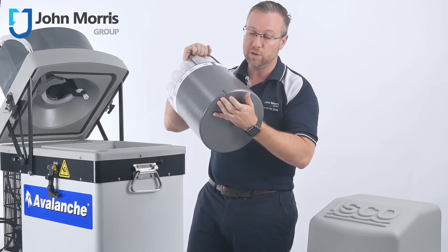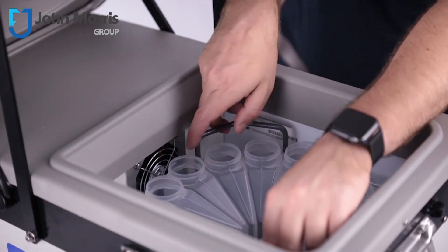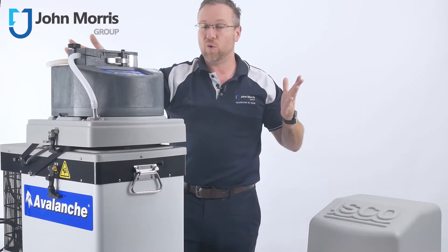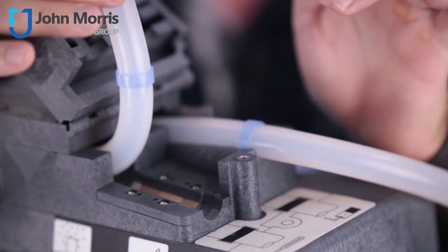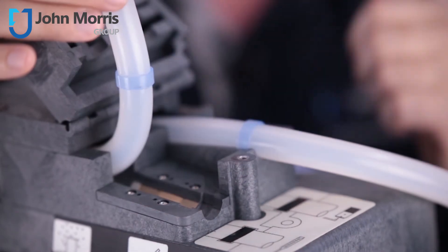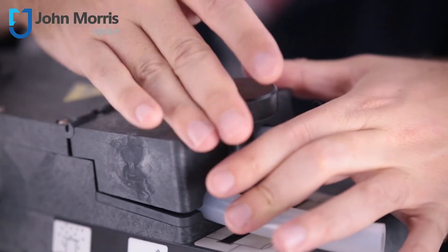On the bottom of the bottle kit, you'll notice there's a little groove which helps you to align the bottle kit in exactly the right position, making sure you're always going to get the right sample in the right bottle. Like all ISCO samplers, it's also got the liquid sensing device underneath the sampling tube. This tells the sampler exactly when liquid is coming up through the suction line, so it knows when it's pumping real liquid — not just air — and can accurately measure and dispense the volume set in the controller.